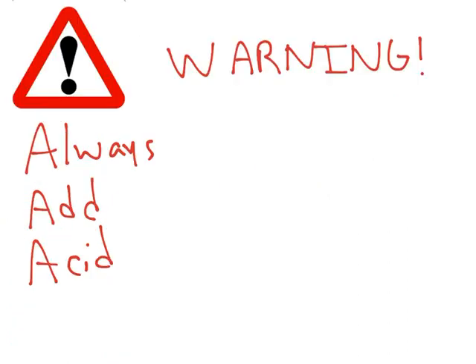Now, a word of warning about diluting acids is that it's important that you always add acid to water. You must always add the acid you are diluting to water. This will prevent the acid from bubbling or splashing as it heats up.